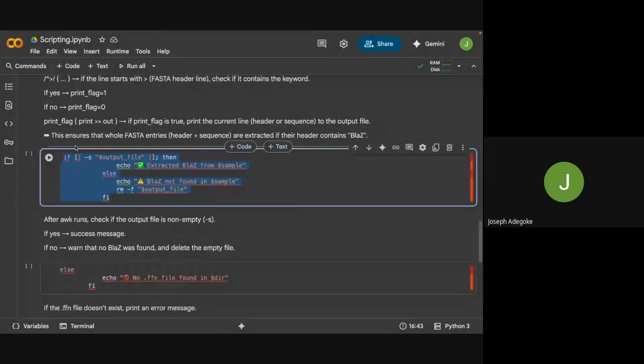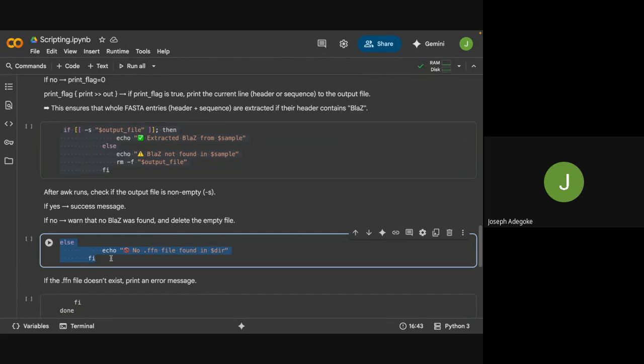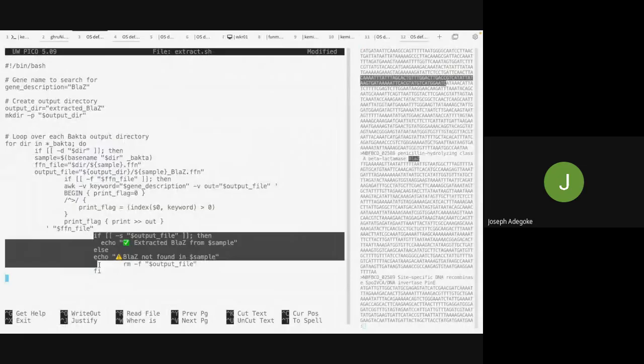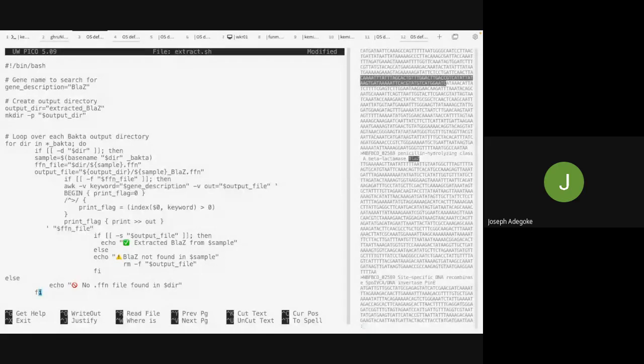We've checked the file to print an error if we have any. The next thing is the first if, which is here, to close the first if, and then the second if. We want to close it too. Sorry for my indentation manner.